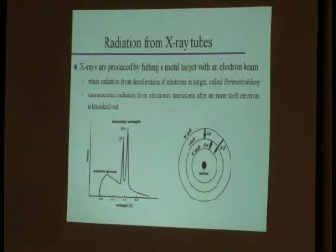What you find often is that you, for example, hear people talk about copper K alpha 1, copper K alpha 2. Well, the reason for that is the L shell has more than one energy level, right? If you think back to your orbitals. And they are very close together in energy. So what you get is several lines that are very close together in wavelength. If you ever look at tables of characteristic wavelengths, you will actually find that. Copper K alpha 1 and K alpha 2 are often not even separated when you do a diffraction experiment.